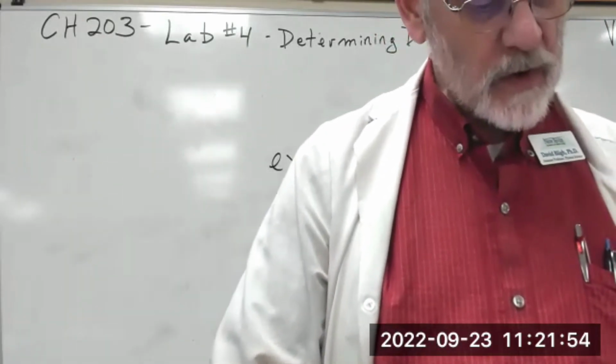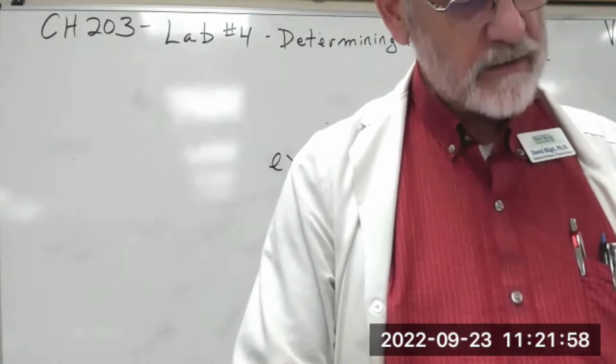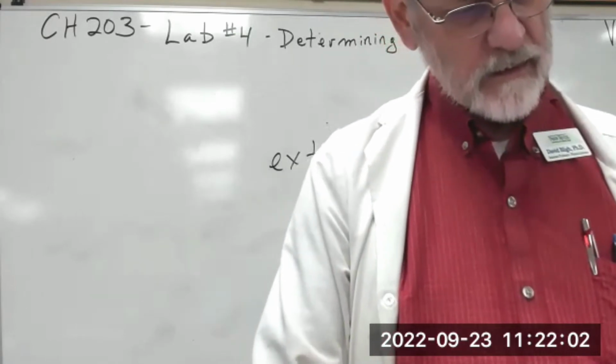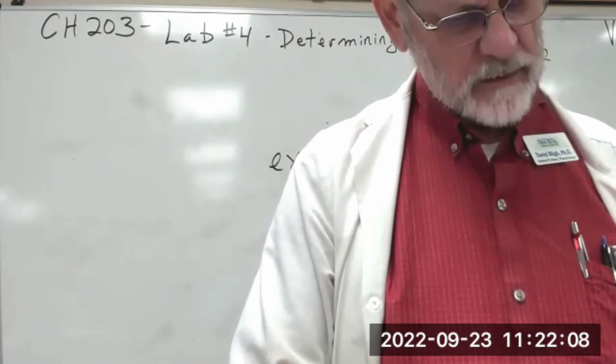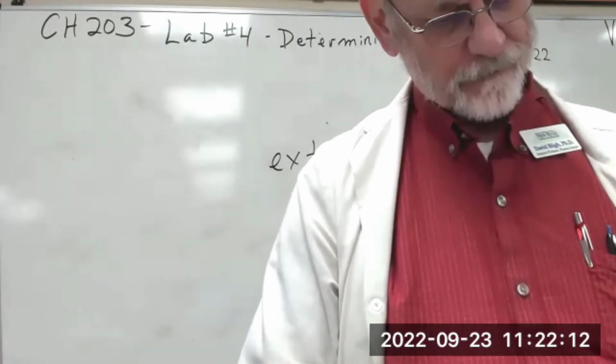Okay, you're going to do duplicate calculations, duplicate determinations. Yes. Well, maybe not all of them. Maybe the first one. And then they have post-lab questions.